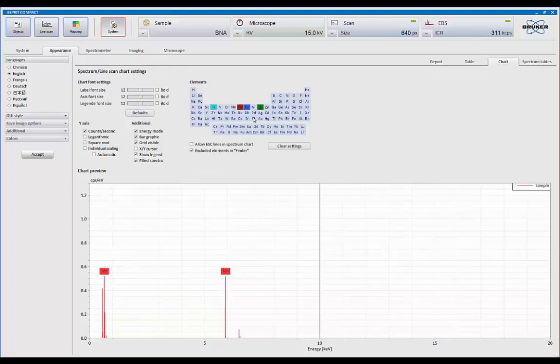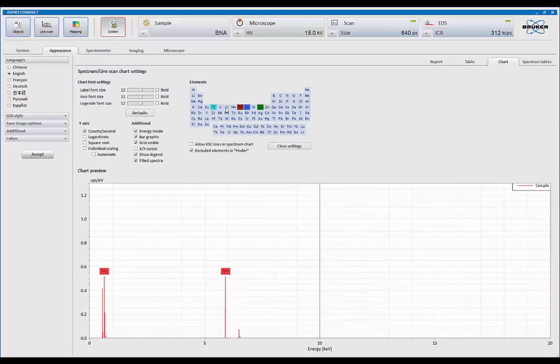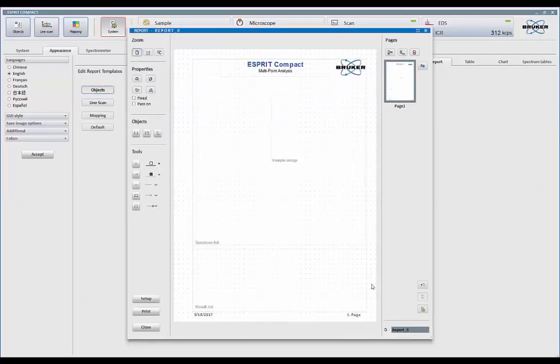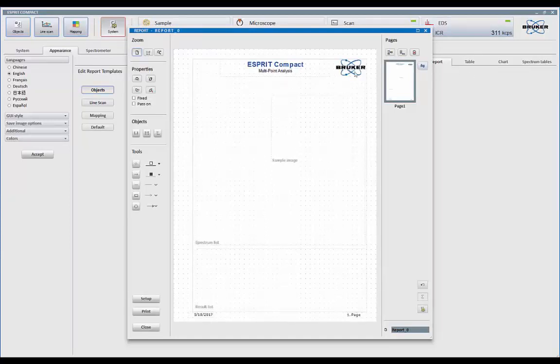You can also customize your display. So how you want your KLMR markers displayed, what language you want to work with, how detailed markers you want. You can also come in here and set up your reports. So you can set these templates up to how you want your report to appear. So this is all user adjustable.